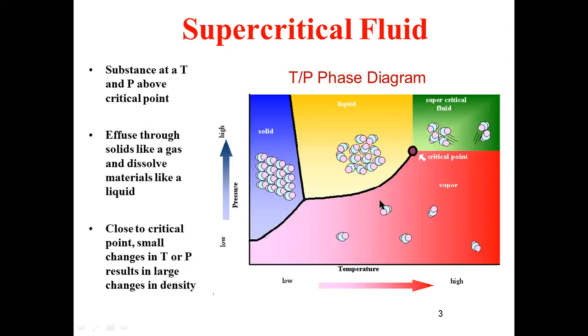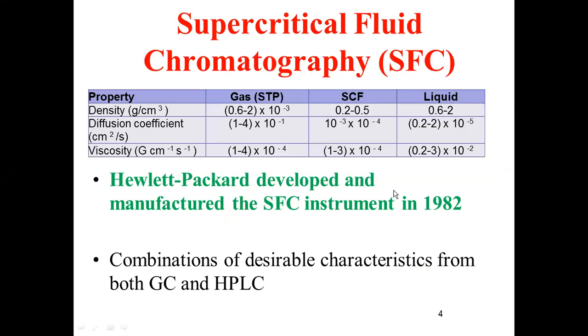And the kinetic energy and intermolecular forces will be distinguishable when you compare the kinetic energy by the virtue of motion of the molecules in supercritical fluids with the intermolecular forces of other substances. So therefore, supercritical fluids are highly advantageous. And if you look at the properties and the statistics with respect to density, diffusion coefficient, and viscosity of supercritical fluids, these values I have presented before also. Supercritical fluids will have higher density when compared to gaseous substances, and even when compared to liquid substances, the density will always be advantageous.